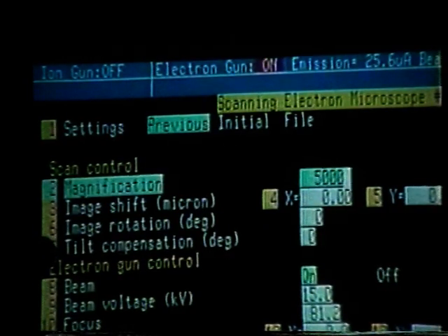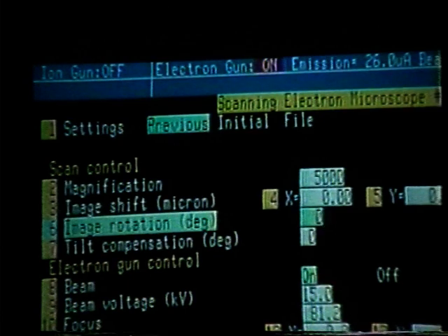We can utilize the image rotation function using function key number 6. We can rotate the sample from 0 to 360 degrees. I would like to utilize this rotation capability in order to square up the image. For ease of analysis, let's slew the rotation.